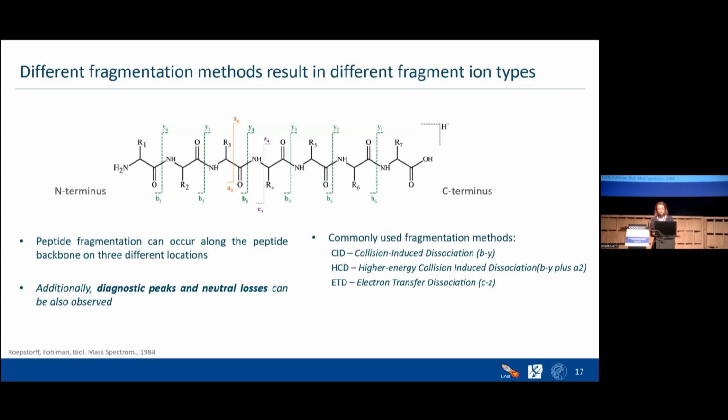There are commonly used fragmentation methods. We have collision-induced dissociation, higher energy collision-induced dissociation, and electron transfer dissociation. They give different fragment ions.